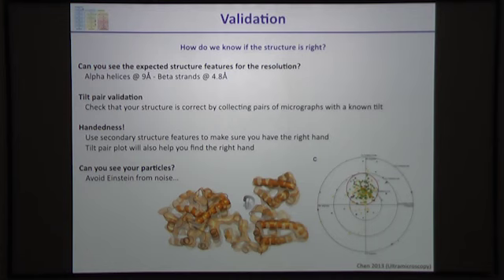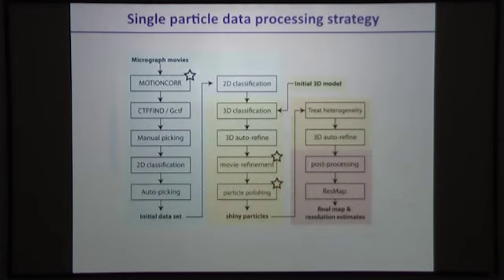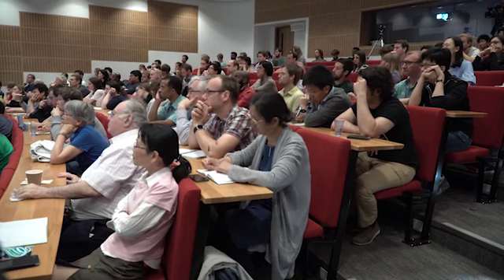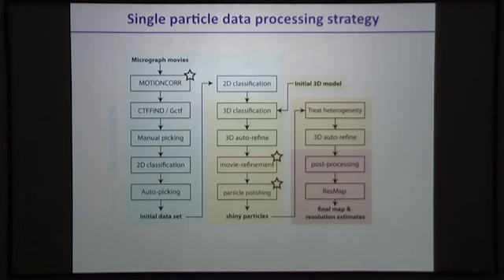And I think it was a bit quick, but that will be all. I hope this was a good overall view of all the different steps that you need to go through and what the important steps in each of them are. And I wanted to mention briefly that one thing that you can do is automate this during data collection, and this can now be done quite easily through RELION with the scheduling of different types of jobs.